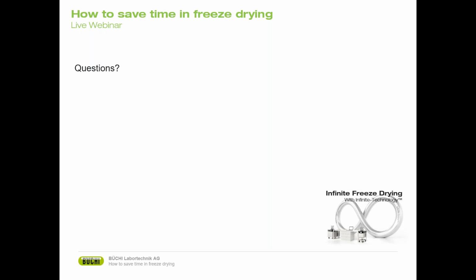Okay, thank you, Moritz. May I just throw in? So you mean that the more homogeneous the sample is, the more accurate the endpoint determination method will be? No, not necessarily, because ideally you have an endpoint criterion that is robust against these variables.